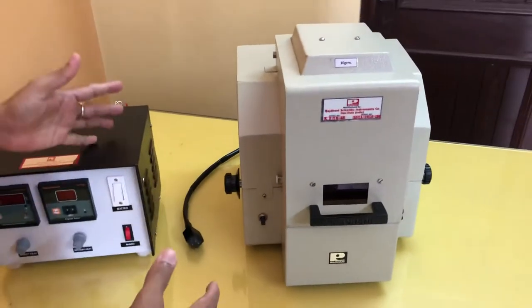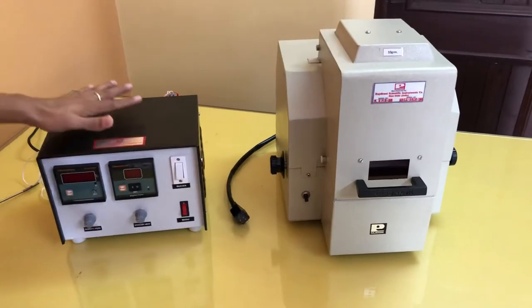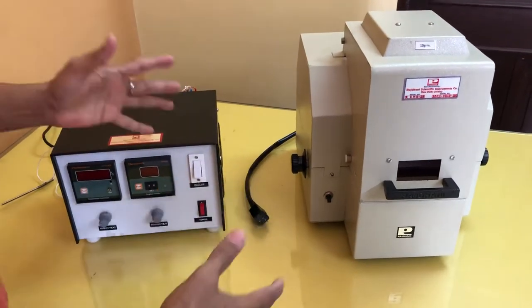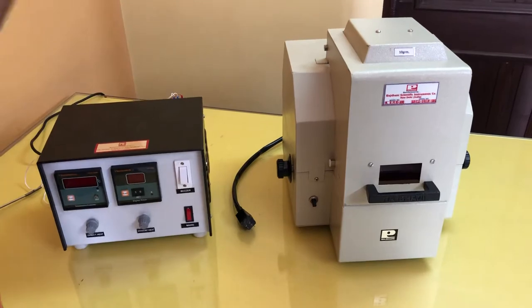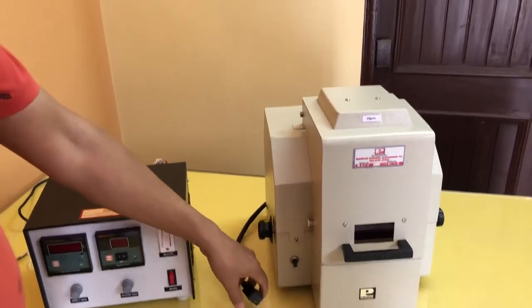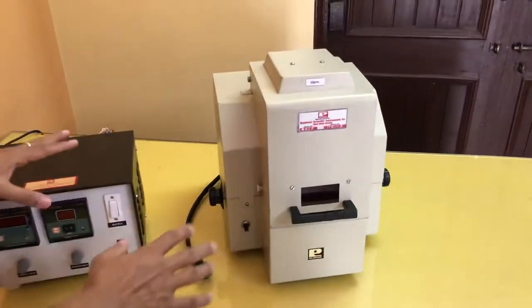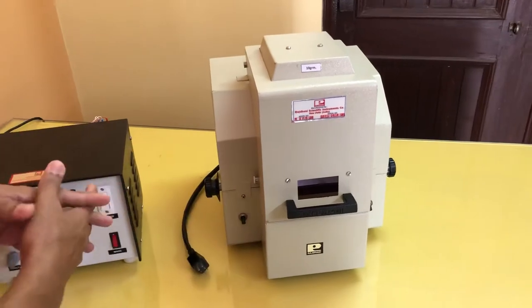Here, as you can see, there are two parts. One is the main instrument unit and one is the control unit. When you receive this instrument in your laboratory, you will see that this unit will be having this connector. To ensure whether it has reached your place safely or not, you have to do a small cross check that I will just tell you.